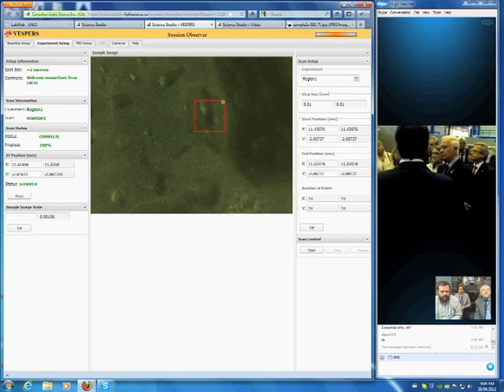We shine the sample with X-rays, and every atom of the sample has its own fingerprint. The atom emits energy, an energy around 3 keV, so we know where that is. How do you know? You see peaks. We do a spectrum, and you see peaks in the spectrum at every point. So, from every point of the spectrum, we can do a map of the sample, so that's what you're going to do.